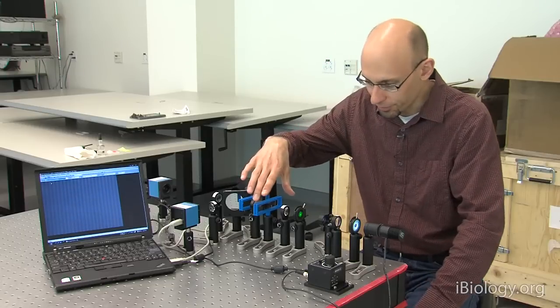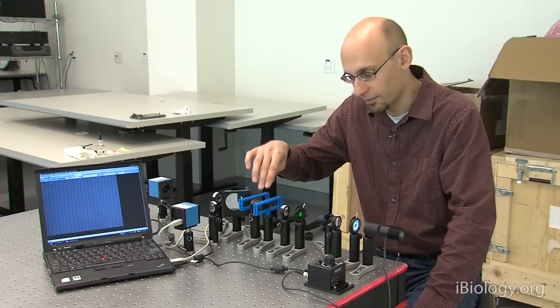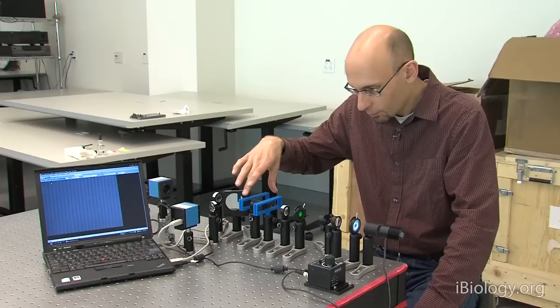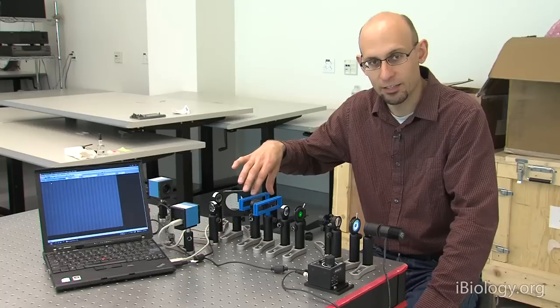This is our sample holder here, and then this is our objective, and this is just another simple lens. It's another plano-convex lens mounted in a lens holder so we can screw it in and out to focus it. We have another sample holder here, and this one is located at the back focal plane of this objective. And I'll have a lot more to say about this later in the lecture.